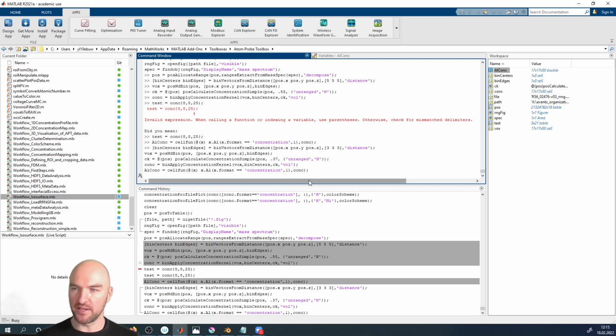And one thing that is really important we don't have right now, that we need to develop in the next time, is a deconvolution kernel. So that if you have mass spectrum overlaps, on a statistical basis you can still pull that apart. And if you do that as a concentration function like here, a concentration kernel, a deconvolution kernel, you can just plug it into proxigrams, you can plug it into voxelizations, you can plug it into analysis of subvolumes, and so on and so forth.